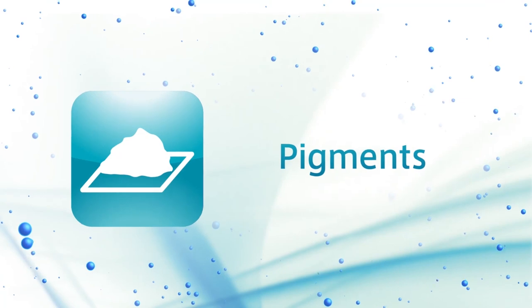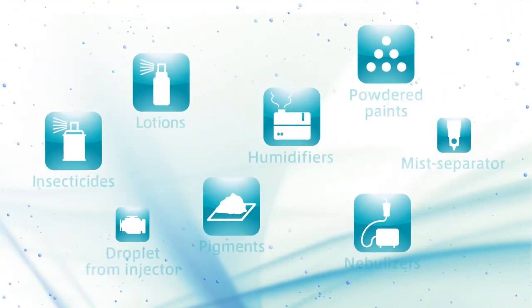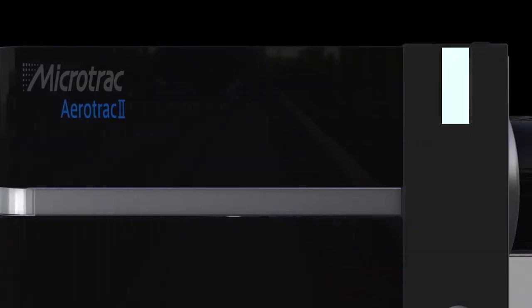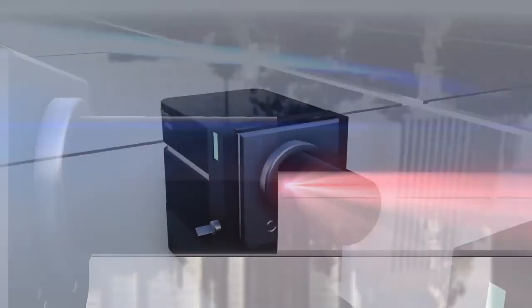Insecticides, lotions, pigments, humidifiers, powdered paints, nebulizers, and more. Aerotrack 2 providing particle size distributions for sprays, mists, and powders.